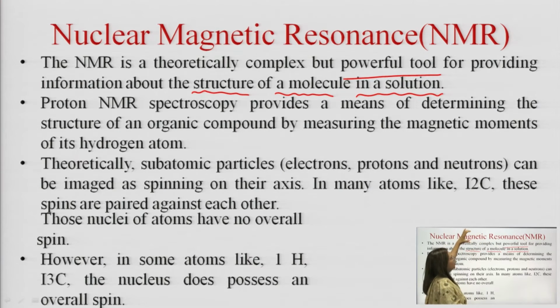This electromagnetic radiation will impact the energy levels of the nuclei, and various changes are registered. The compilation of all the complex changes is recorded, and then the structure is computed.